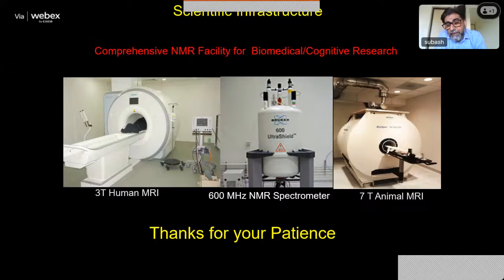And a major application of this spectrometer now is in NMR metabolomics, where you subject urine or serum or saliva or any body fluid to the NMR experiment to detect disease, and find biomarkers or fingerprints of a particular disease condition.